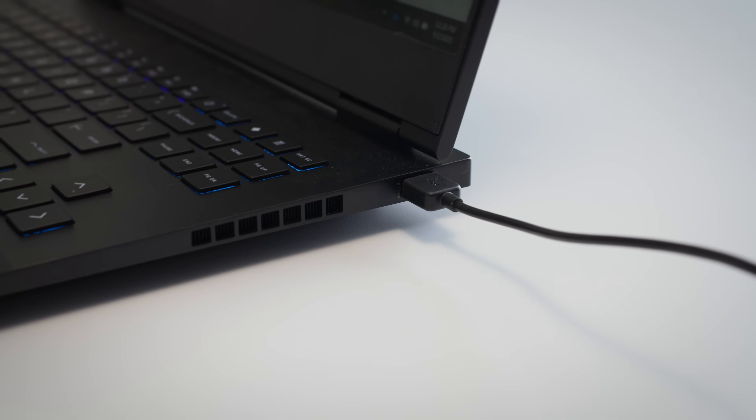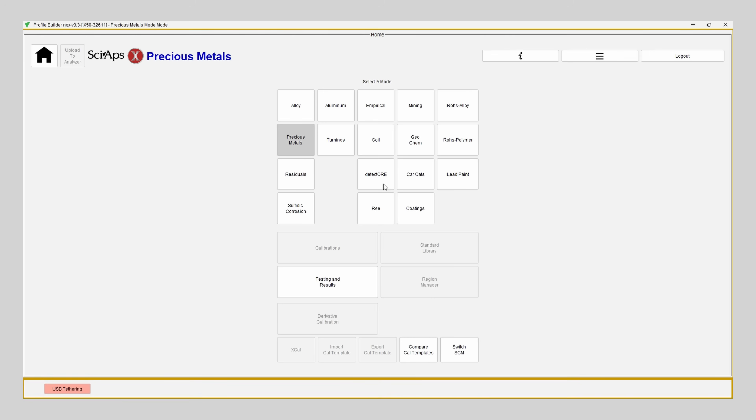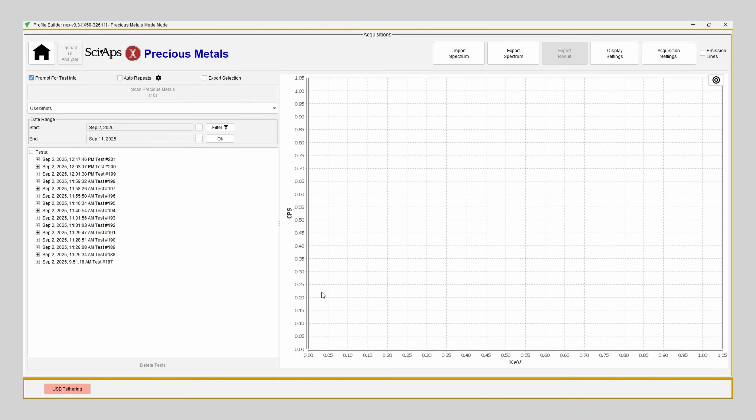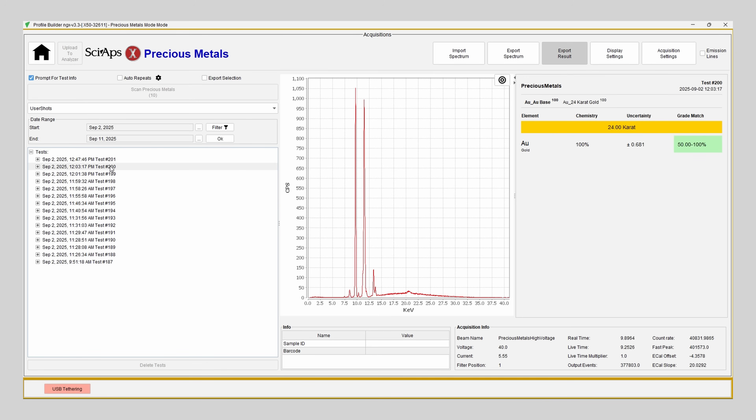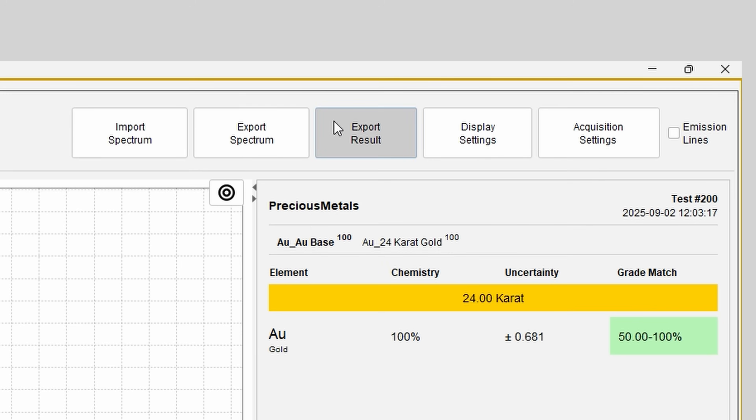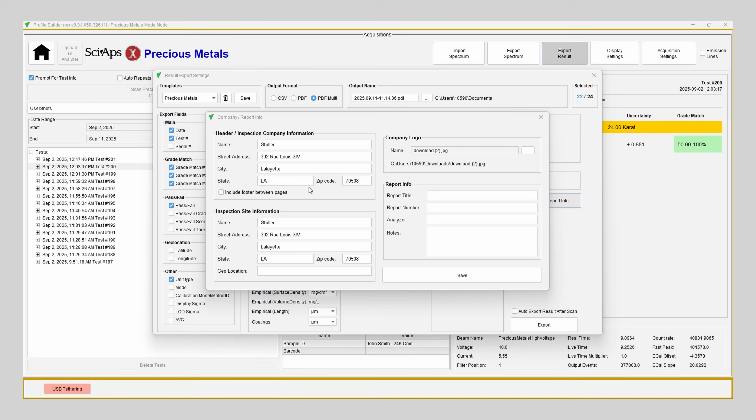The software you installed from the flash drive will recognize the device. You'll need to download the test results from the analyzer into the program. From there, you can take a deeper dive into each scan — the software lets you review detailed breakdowns and create custom reports that you can print or share with your customers.